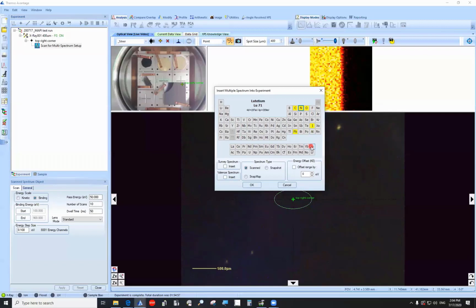Can we select hydrogen? Hydrogen? Yeah. What transition would we be looking for hydrogen? Because it has CH3, NH3, it has carbon, hydrogen. No, I understand that, but think about what you're trying to look for there, right? What is the transition energy for a hydrogen electron? So are we really sensitive to that or not?